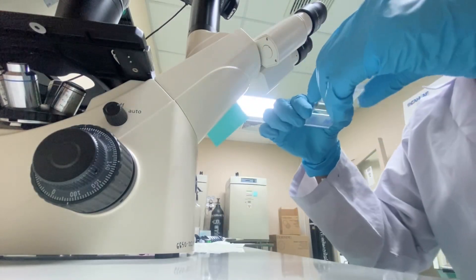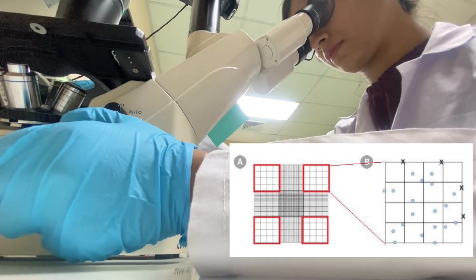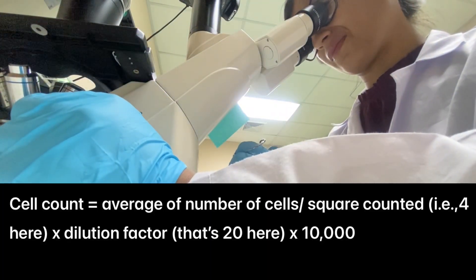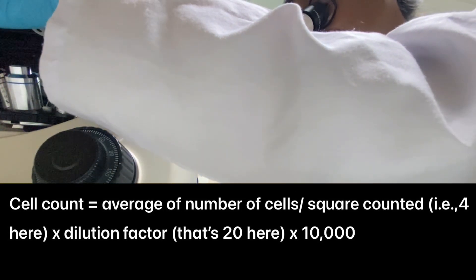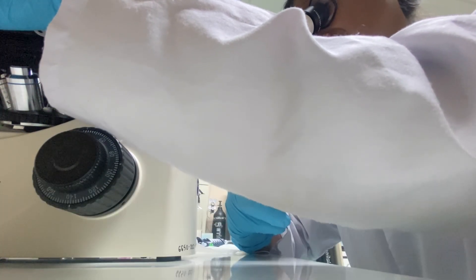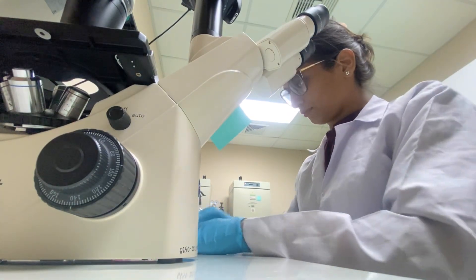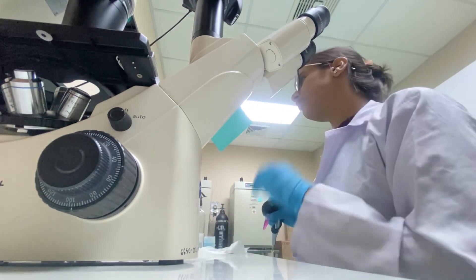Now it's time to place it under the microscope. The rule is to count the cells present in the four outer bigger boxes, then take an average and use the formula according to your cell dilution. I do this three times so I can put all the values into my formula. I always keep a notebook beside my bench because it's easy to forget and mix up the numbers.